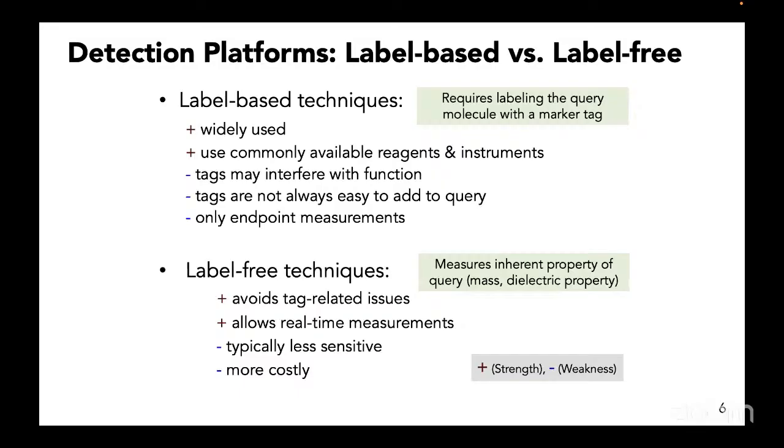So alternative approaches are label-free technologies, where we look at the inherent properties of two biomolecules. If two molecules are interacting, there will be some change: some mass change, some dielectric property change, some interference change. Some change happens when two molecules collide. Can we not label them, but rather look at the changes happening on these proteins based on other molecular changes with the inherent properties? So different types of label-free approaches have come forward, which use this approach to make measurements in a label-free manner.